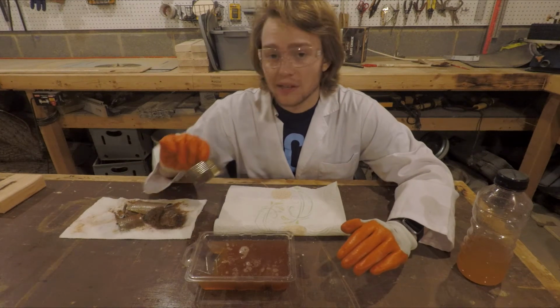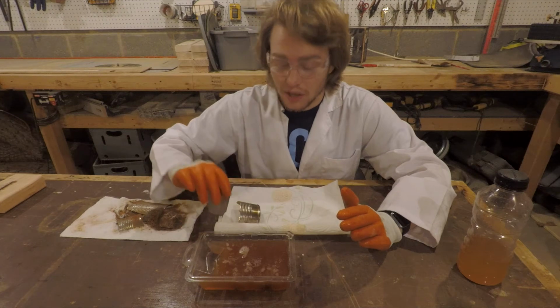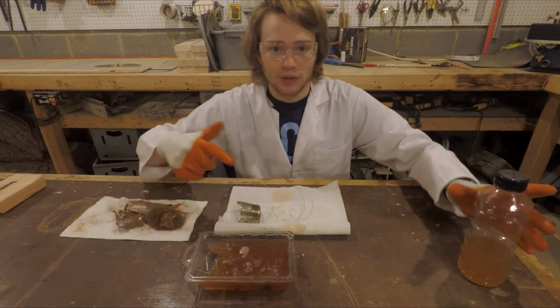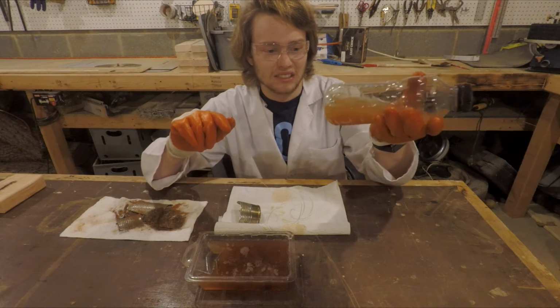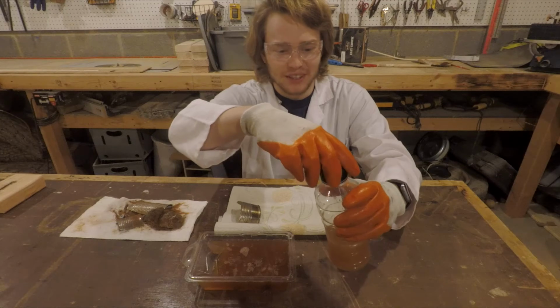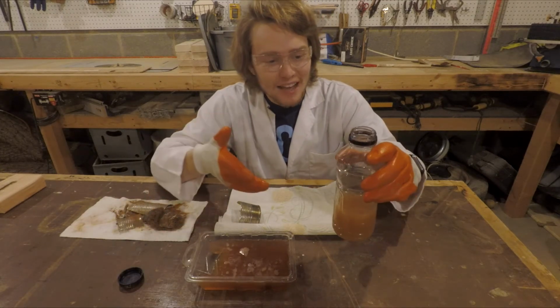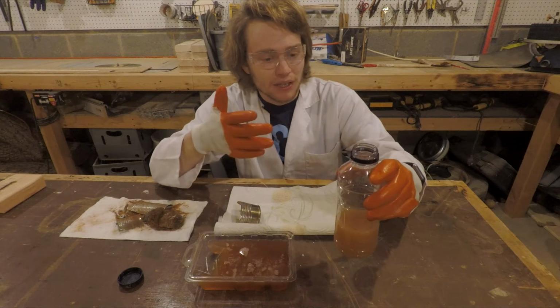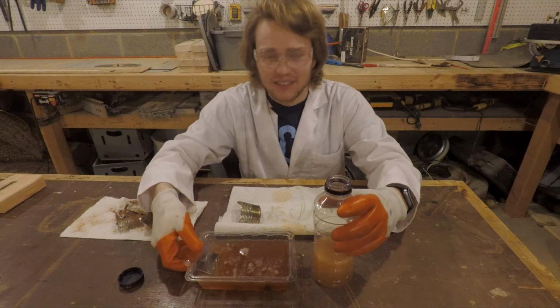But it does have a protective coating, so this is an important thing that we do these days to protect metal that we don't want to rust. And I'm going to dump this out into this disgusting mix of rust juice. Ugh. Oh, that was weird. Huh, that's actually funny. So I guess some gas formed. I let this sit for maybe a day or two, and I guess some gas formed, so it was pressurized inside. Neat.